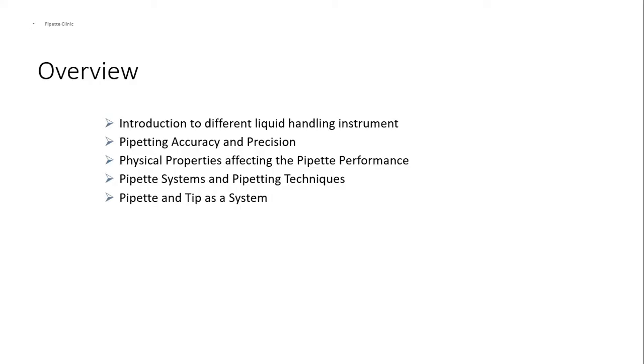In this lecture, we will introduce you to different liquid handling instruments. After this, you can choose the most suitable instrument for your application. After that, we will define accuracy and precision and how we can achieve the best measurements. We will also educate you on the pipetting system and pipetting techniques. After this, you will have efficient pipetting.